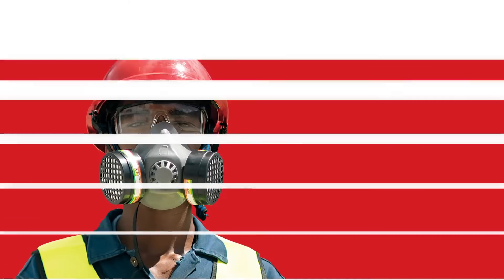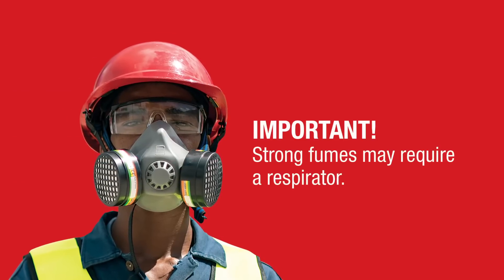If you are dealing with a chemical that gives off strong fumes, you may need to use a respirator.